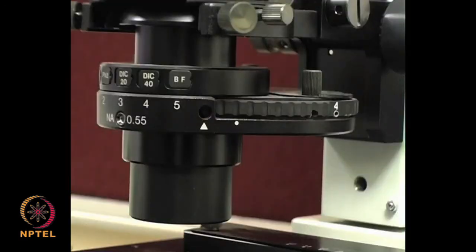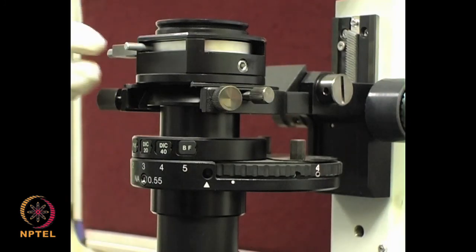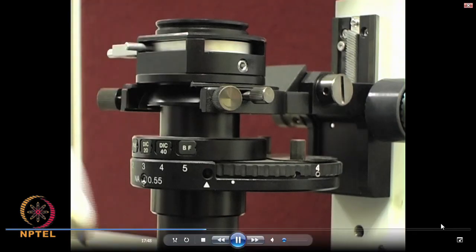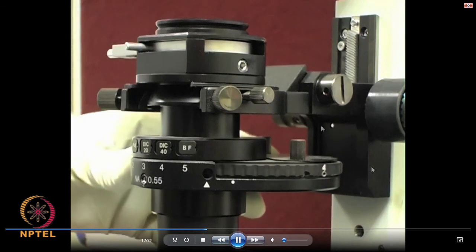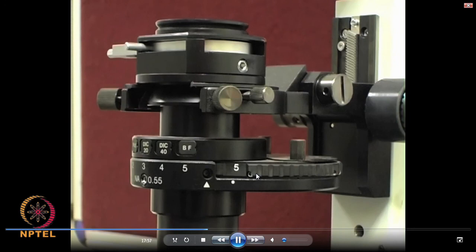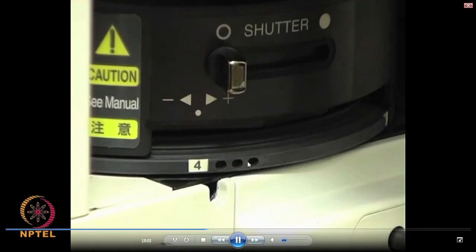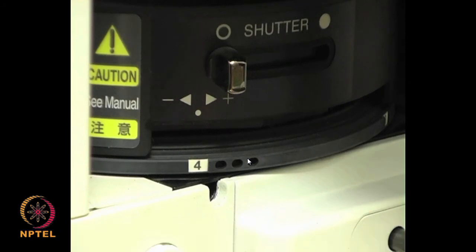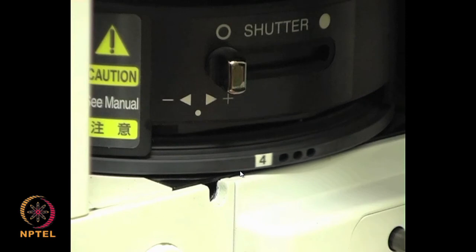As I told in the last class, we have to choose an appropriate aperture. Right now we do not require a polarizer, so it is in bright field mode. Here we have to change the condenser apertures and filters to bright field mode, and first we will look at these objects in bright field mode.